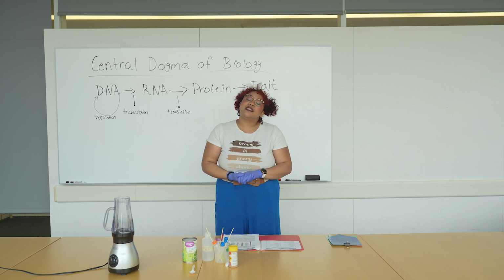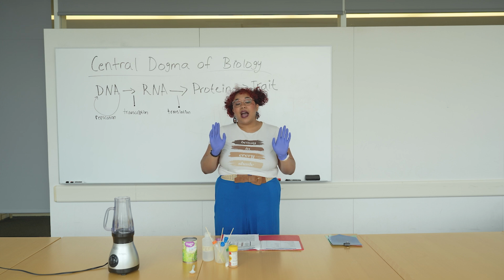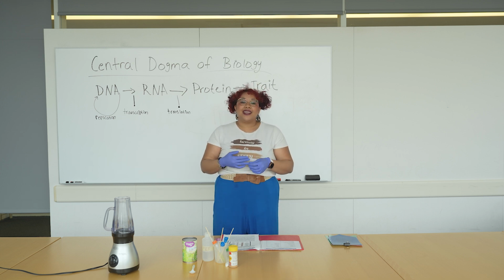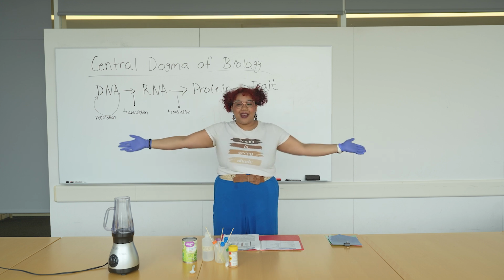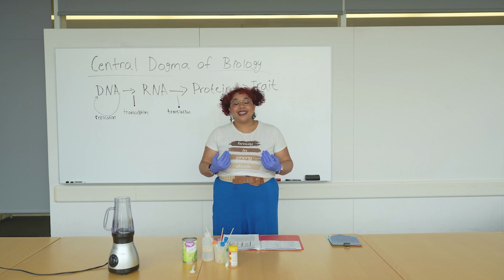And so for today's activity, we'll get to actually visualize what DNA is. DNA is really small, but it actually can be even longer than my arm span if we were to take all the DNA from my own body and extract it.